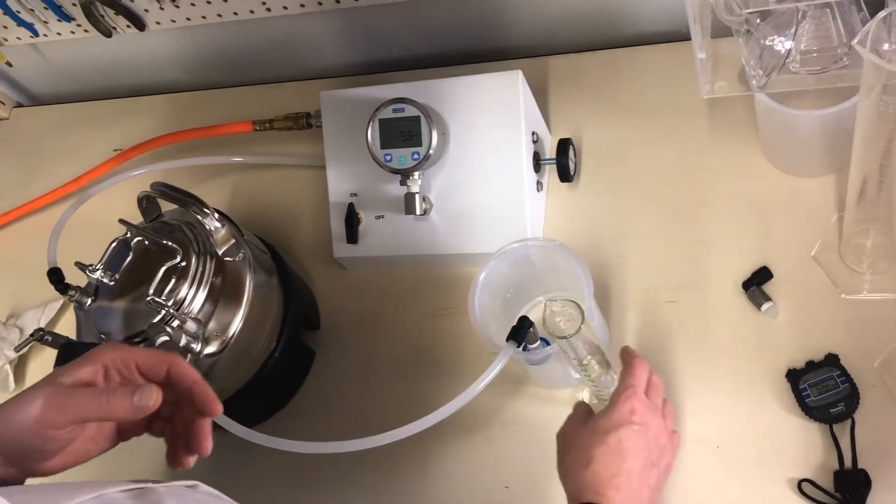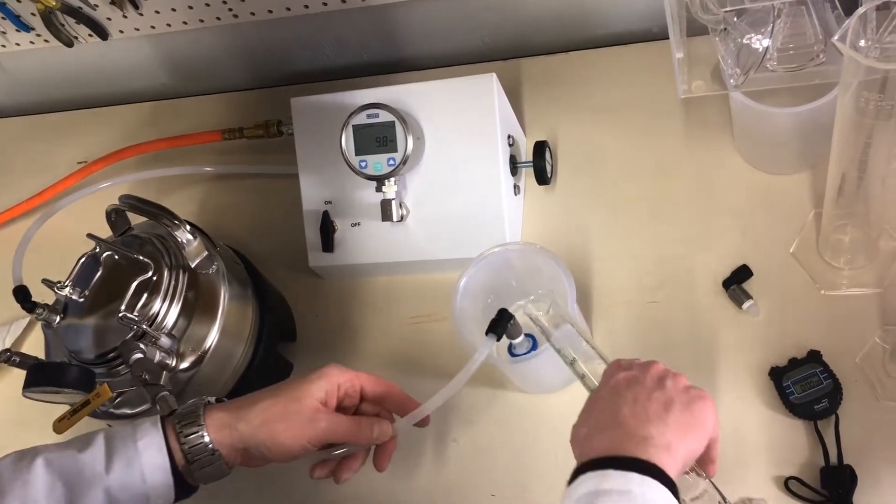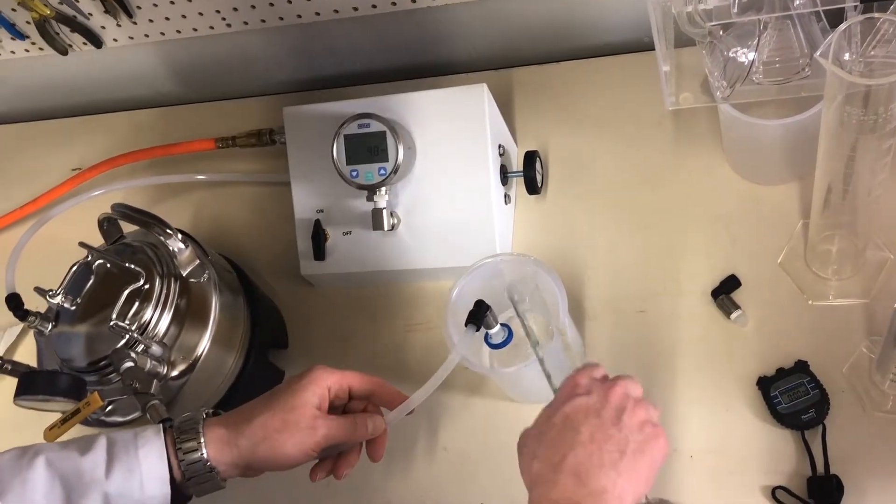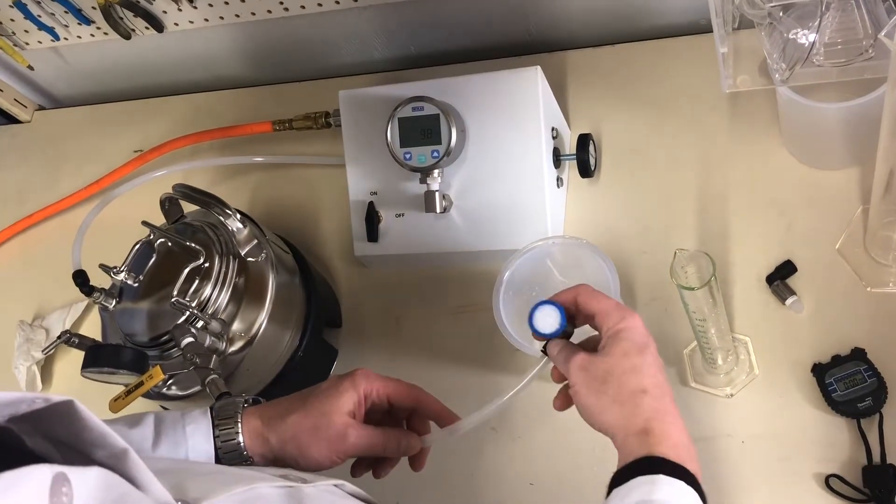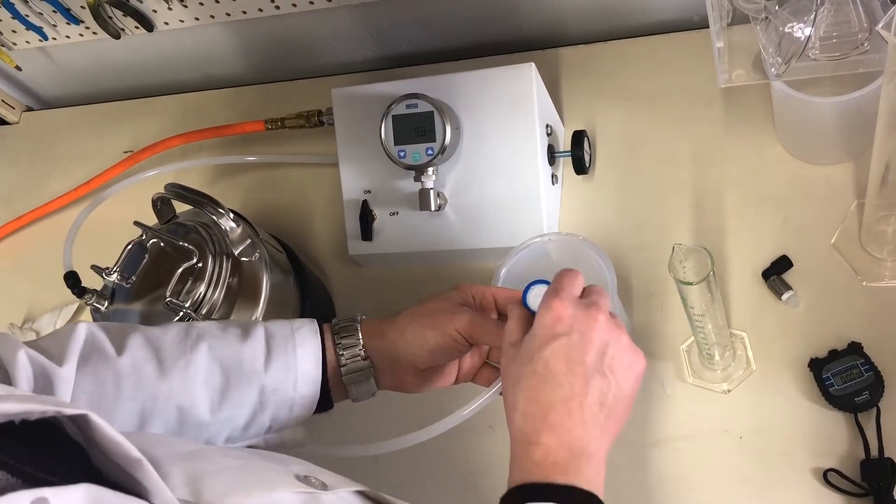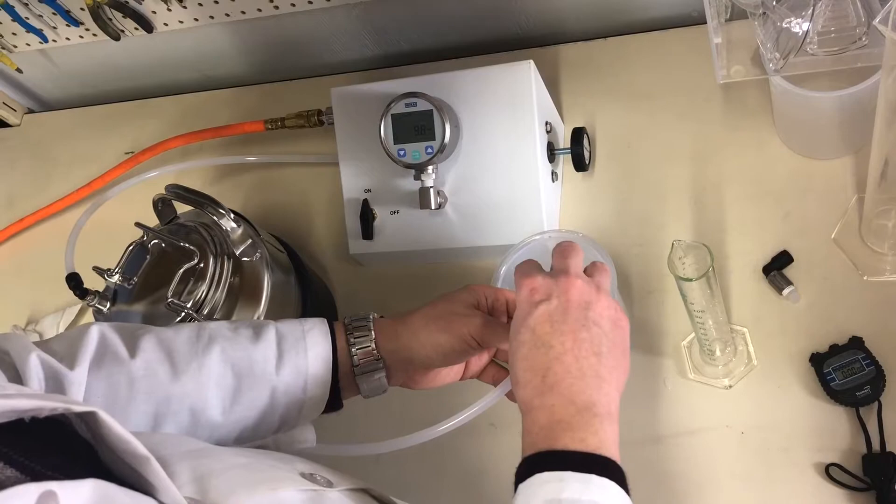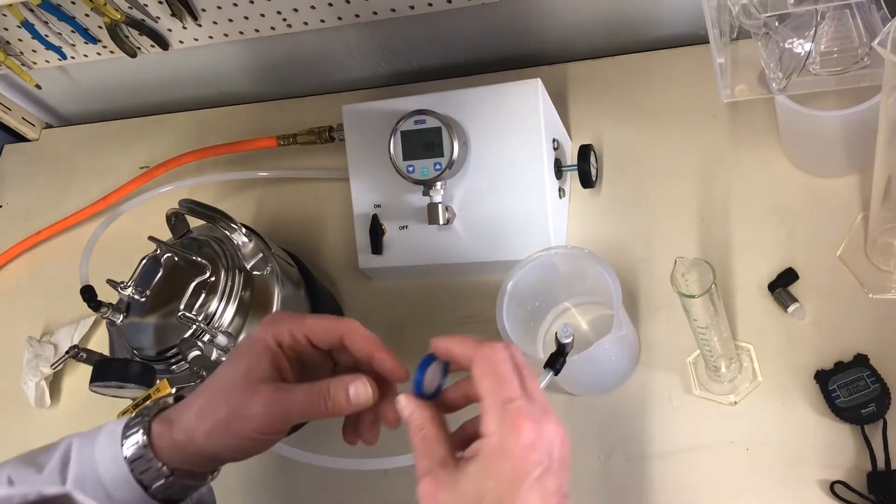The pressure should be pretty stable, and then we'll dump this into the collection beaker, and then we finished. Rotate counterclockwise to remove the filter, and it's on to the next one.